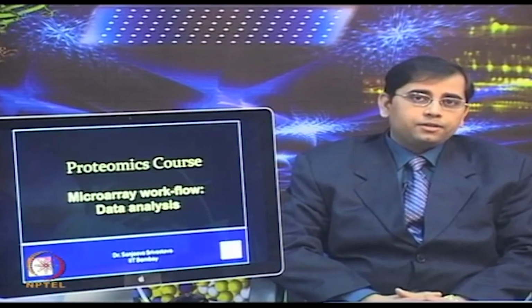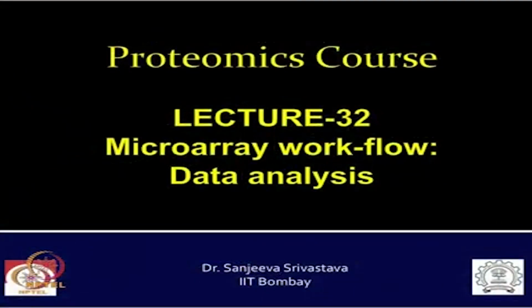In today's lecture, we will talk about microarray workflow, especially focusing on data analysis. This is in continuation of our previous lectures, where we talked about different strategies involved in performing microarray experiments, how to acquire good images, and now today we would like to discuss image analysis.